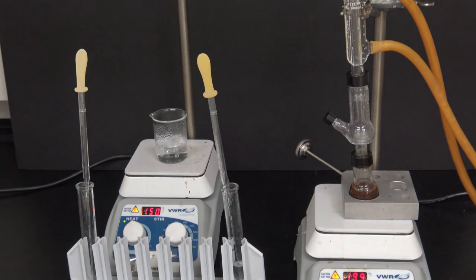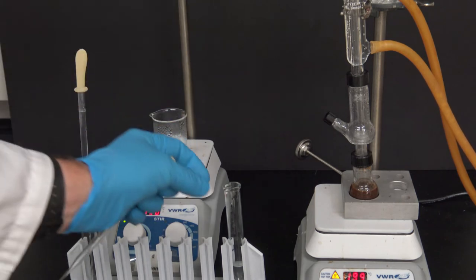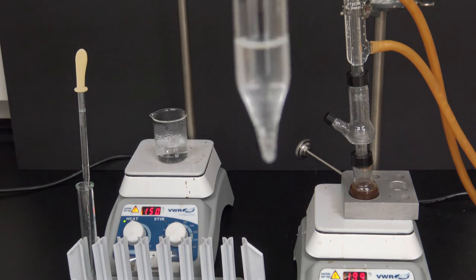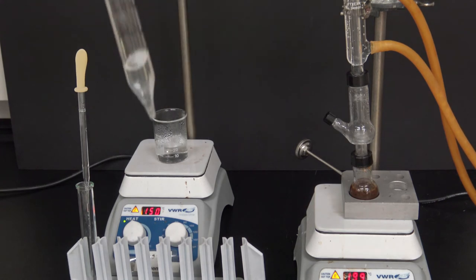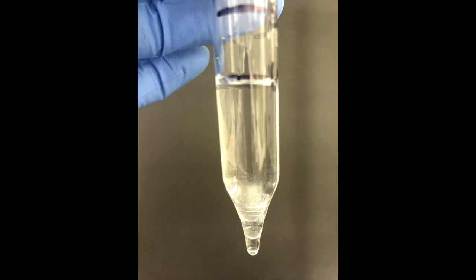It's been about 2 hours now, so it's taken a long time to collect this material. But I can start to see oils in the bottom of my conical flask. I'm just going to bring that up and hopefully it'll focus on there. This is a close-up view of my test tube, and you can see there's sort of an oily bubble at the bottom. That is my essential oils.